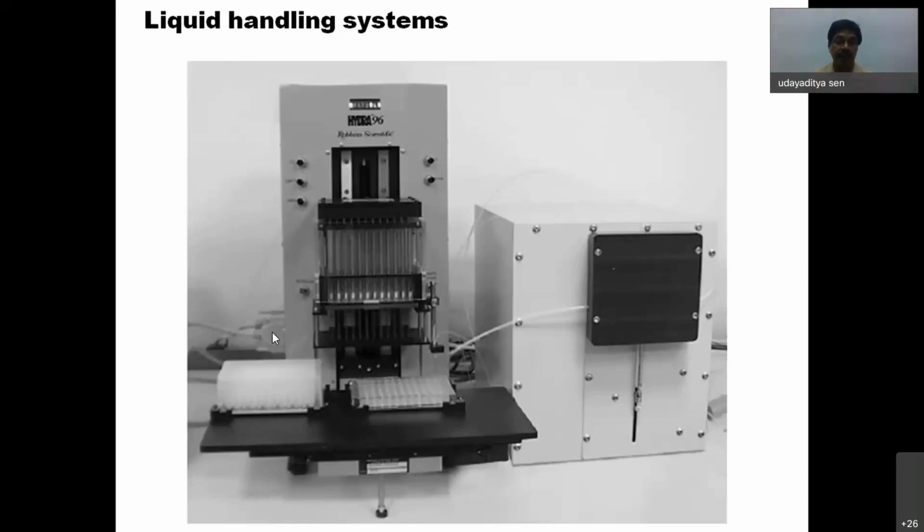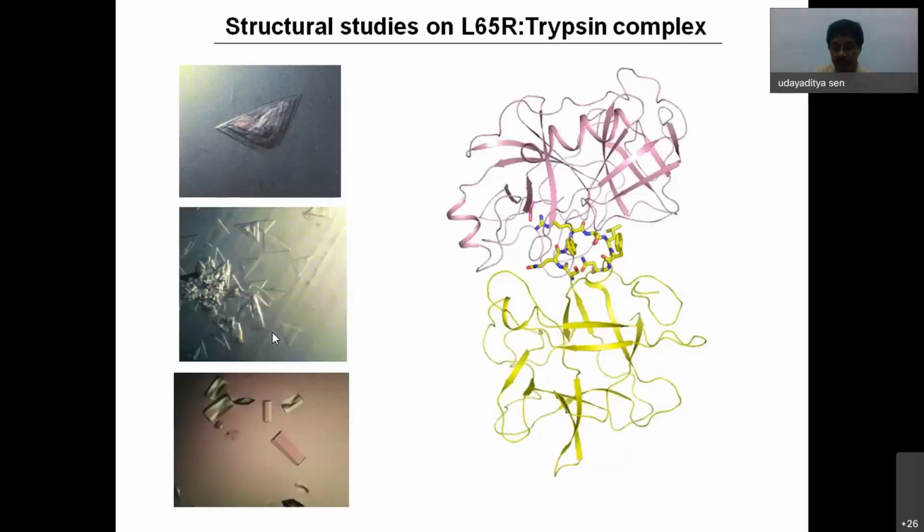And similarly, microgravity can also change crystallization, because to crystallize something, there is the concentration variation in the drop, and whether there is gravitation or no gravitation can affect the concentration difference and convection current of protein in the drop. So this is about my crystallization.